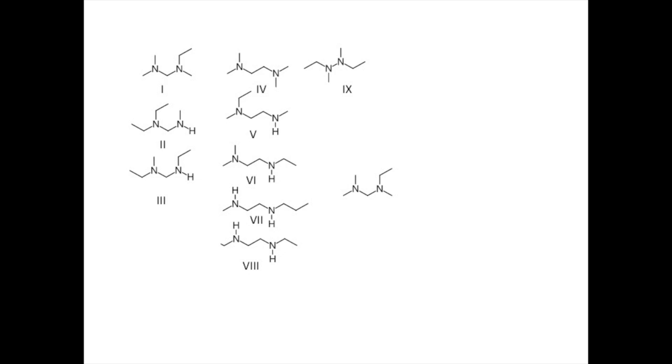Let's consider the first structure. If we ionize the nitrogen atom on the right, then the radical will try to form a new bond with an adjacent atom, and we break off a neutral methyl radical. Notice that we needed to have an ethyl group attached to the nitrogen for this to work out. Structure 4 does not meet this criterion, so we can rule it out.